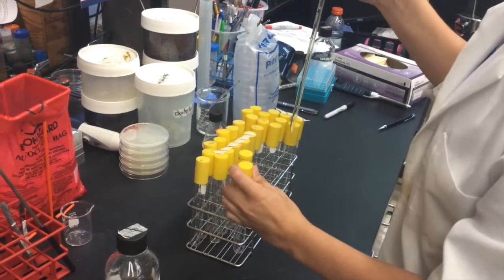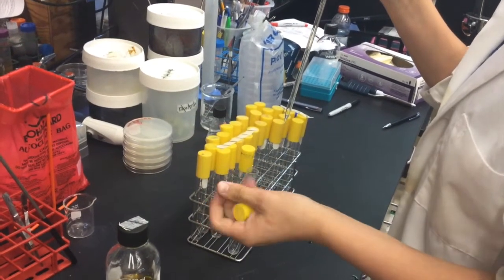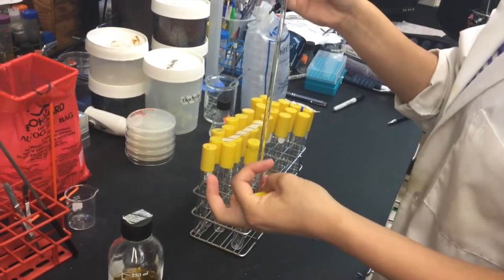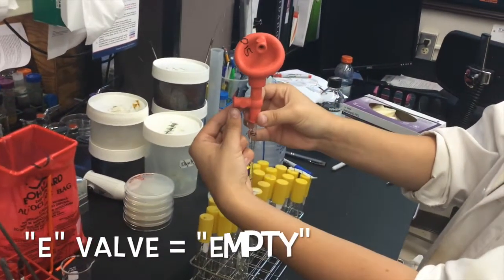Using your left hand again, remove the cap from the glass tube and do not set it down. Then transfer the fluid from the pipette into the tube, pressing the E valve.